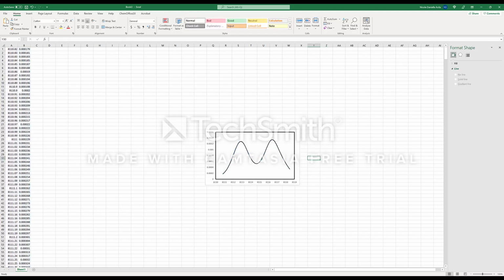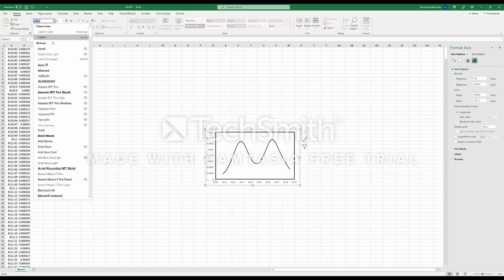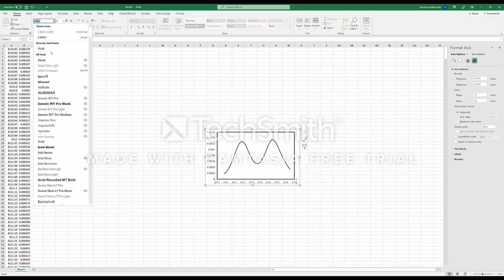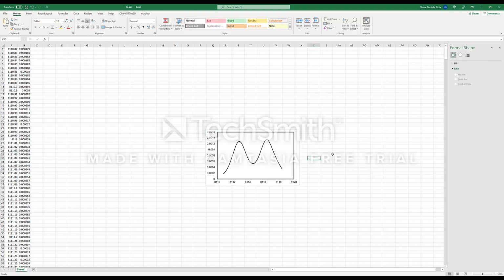And as you can see, it's really, really nice. These you can change to, I really like using either Arial or Times, but I'm going to use Arial for this tutorial. I like to keep my font around 10. You can do that. This is really all to your customization, of course, really just whatever you want. I just really like to make sure that everything is super, super consistent and formal. And there is your graph.